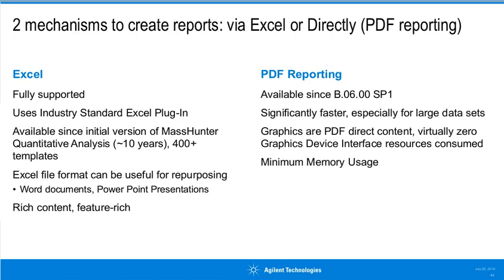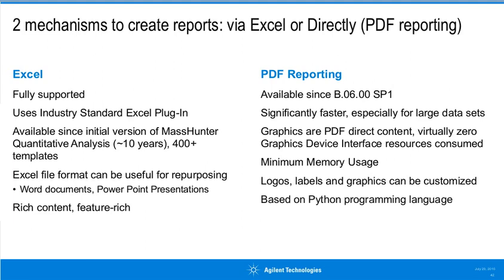It uses minimum memory, and as I shared, the logos, labels, and graphics can be customized. It's based on the Python programming language, which might be of some interest to some of you. Python as a programming language was voted the most popular in 2013. And this PDF reporting is our foundation for taking advantage of some of the Python features in order to do the fileless integration with LIMS, or a laboratory information system.